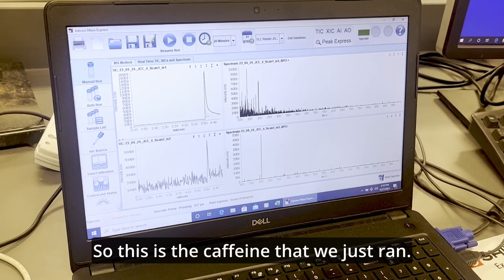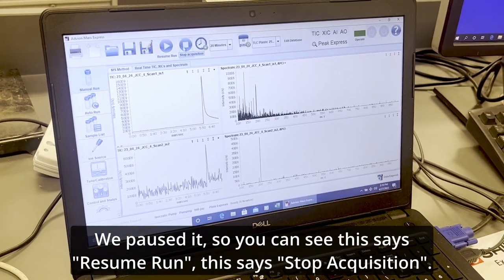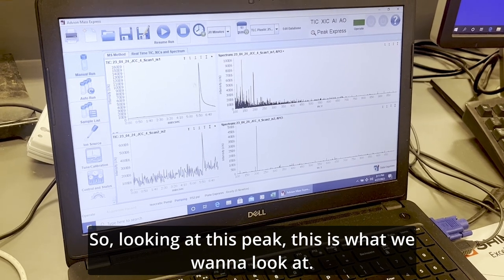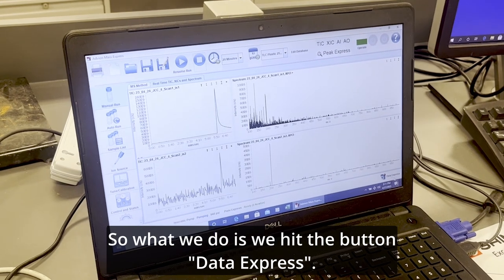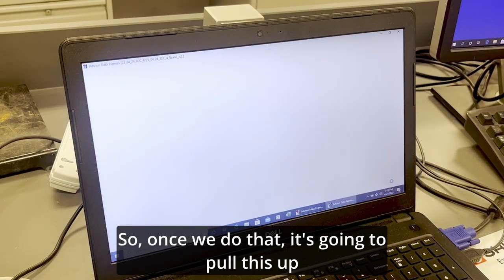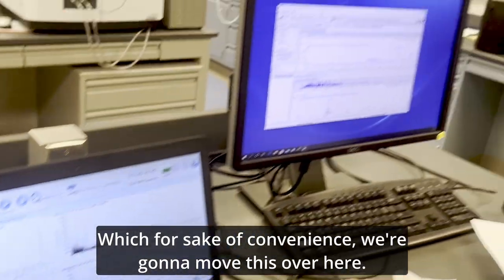So this is the caffeine that we just ran. We paused it. So you can see this says resume run. This is stop acquisition. So looking at this peak, this is what we want to look at. So what we do is we hit the button data express. So once we do that, it's going to pull this up, which for sake of convenience, we're going to move this over here.